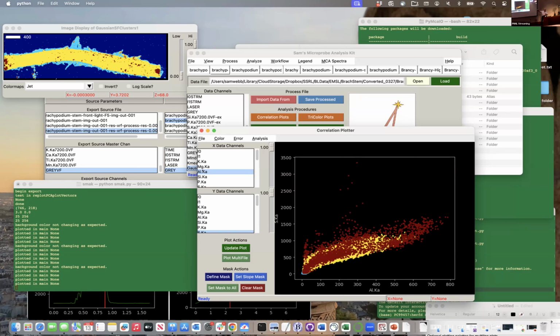But anyway, it's really powerful to see this in here, to see how it distributes it. And what's really fun then, I'll just mention this because it would take too long to do in real life here, is that now I can take those clusters, and I could cluster on my sulfur and XRF data. And then I have my matrix transformation to show me where my mass spec data is. I can now click on different points to look at that data.